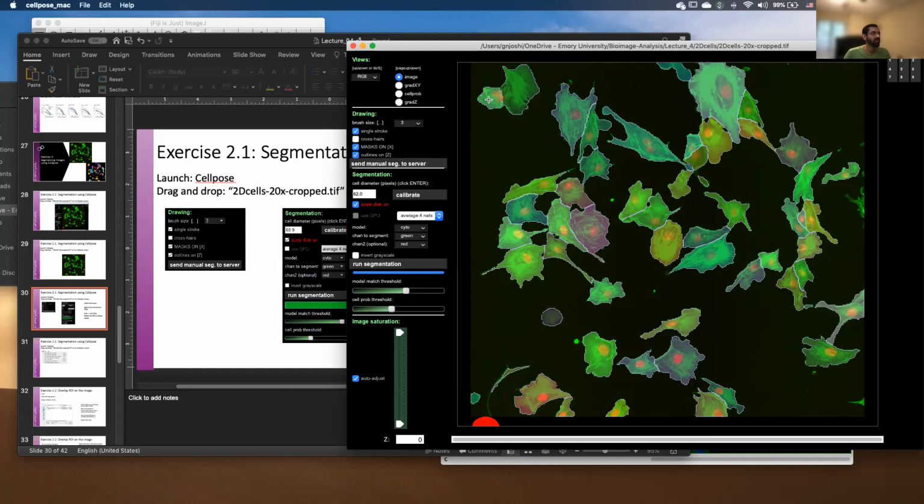So let's say this is one cell. So I removed that ROI. I know that this is not of my interest. I want to remove this. So it's command and left click. I removed it, removed this ROI.